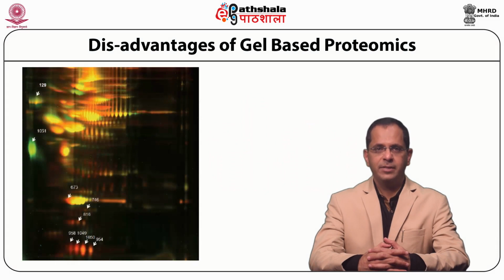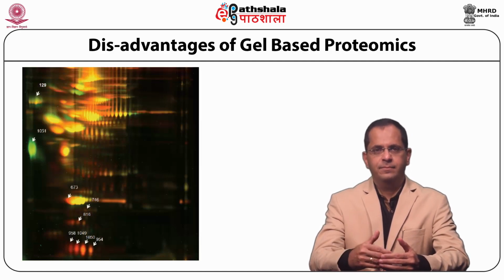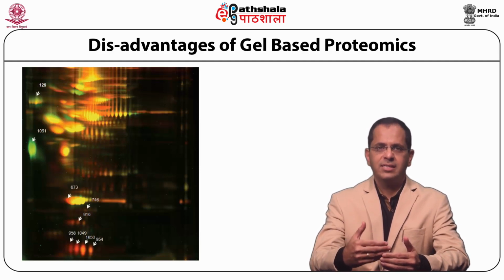Before we get into this particular module, let's try to understand the concept of proteomics. A proteome is a portmanteau of protein and genome. This was conceived by Professor Mark Wilkins in the year 1994.